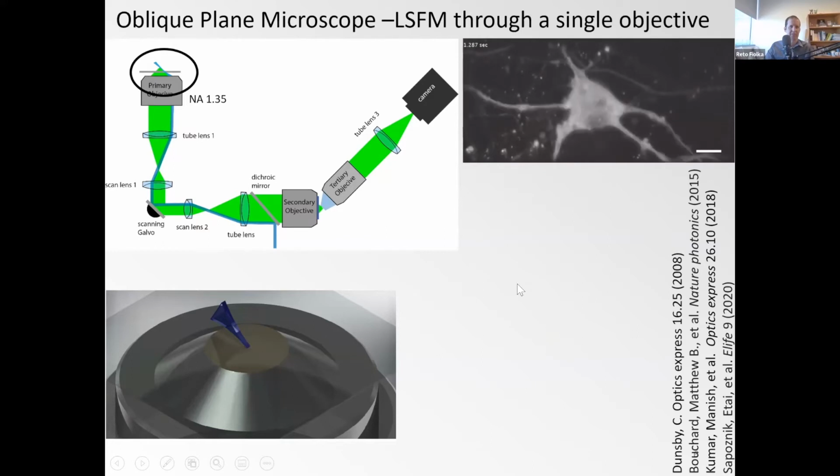This, as I said, has been around. It hasn't been on my radar, because one of the big disadvantages is that you use a high NA objective, but in the end you achieve rather modest spatial resolution. So typically down to the range of micron resolution, simply because you lose a lot of light. That lowers your sensitivity, but also your resolving power by essentially picking up the image at these tilted angles.